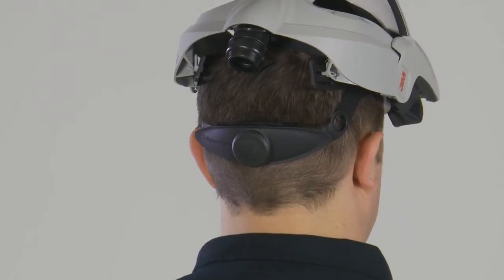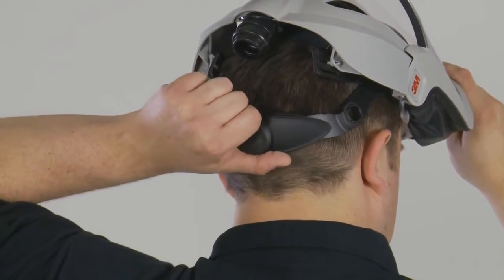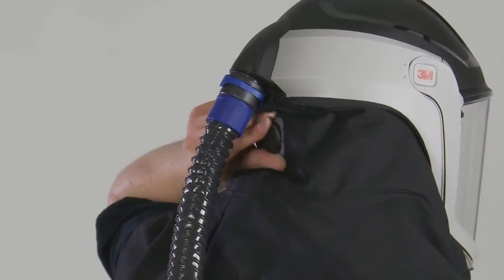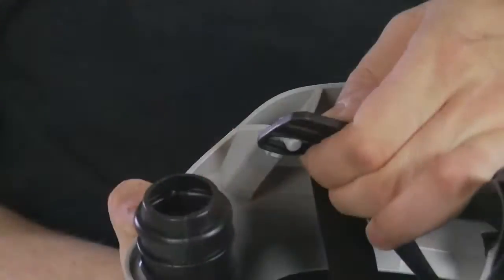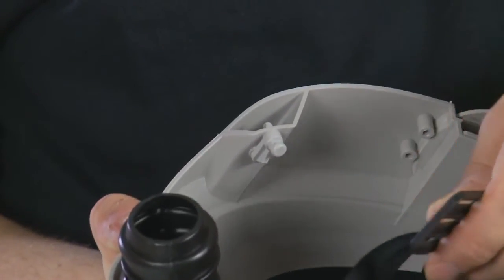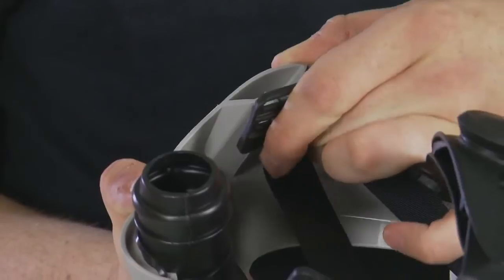Your head top should be adjusted to give the best seal and field of vision. The head suspension can be adjusted simply by rotating the ratchet knob to loosen or tighten the headband. The height of the suspension headband can be adjusted independently in four locations to give a customised fit.